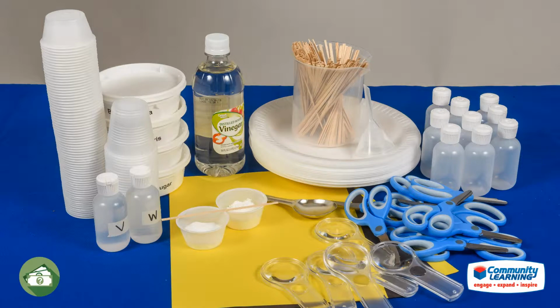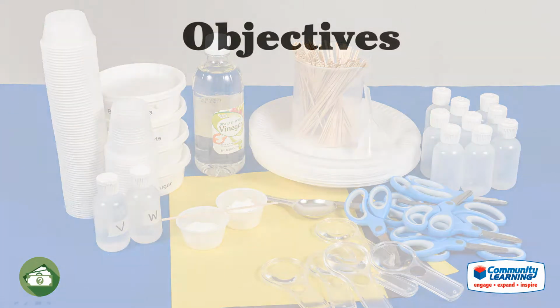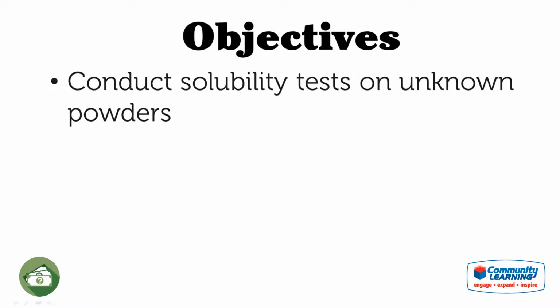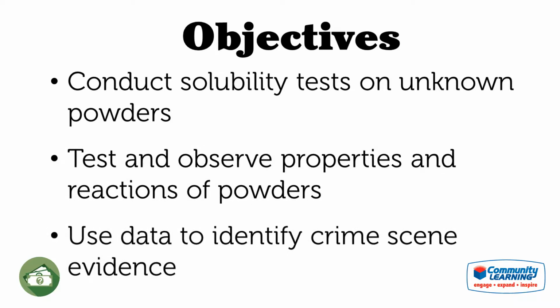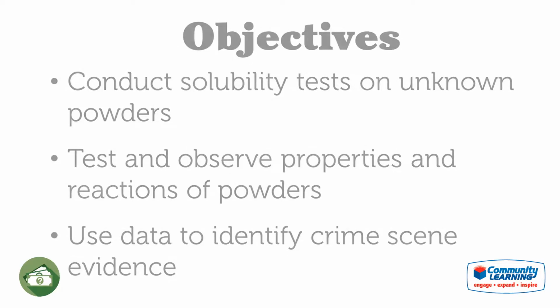Before beginning, get familiar with the materials you will use for this activity. In this lesson, students will conduct a solubility test to determine if powders create solutions or suspensions, test and record observations of various powders and their reactions, and identify crime scene evidence based upon the recorded data.